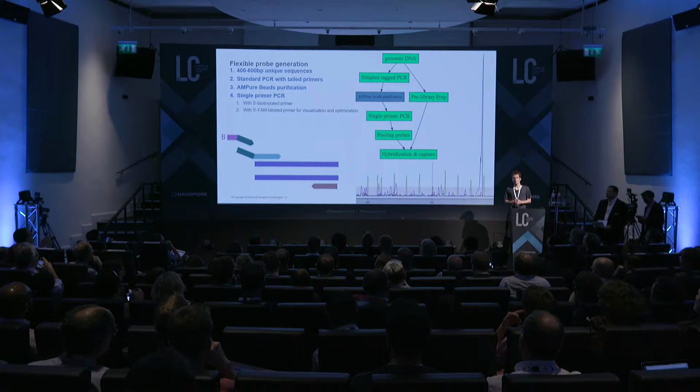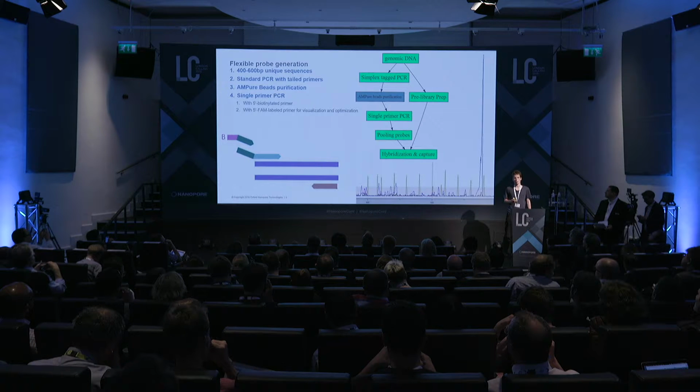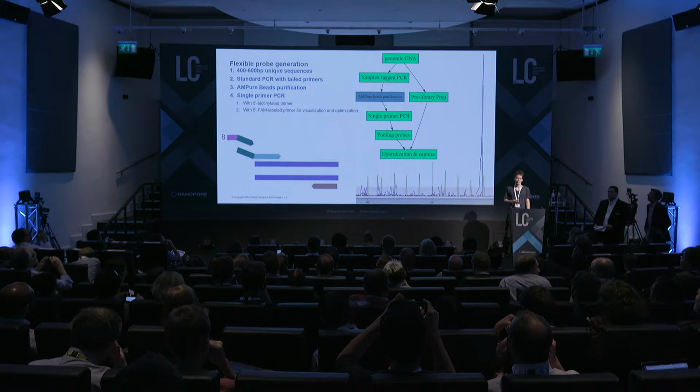For target capture, probes are required. And especially for longer probes, it's getting quite expensive to have those commercially ordered. So therefore, I propose this simple strategy.